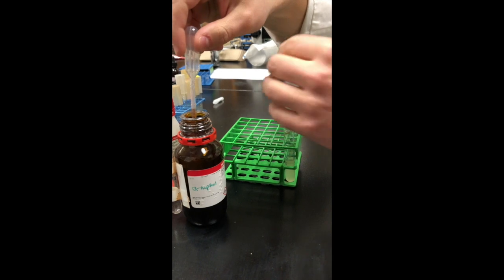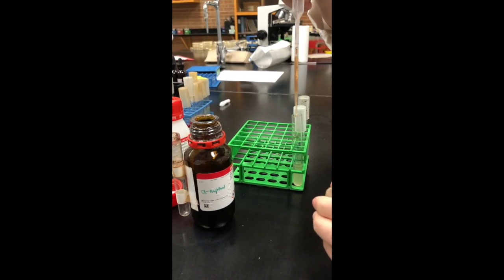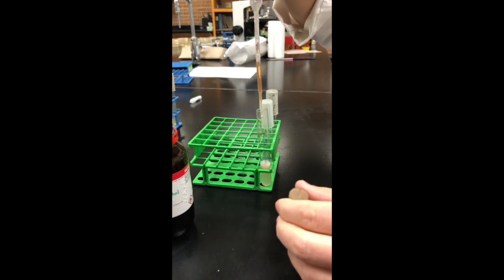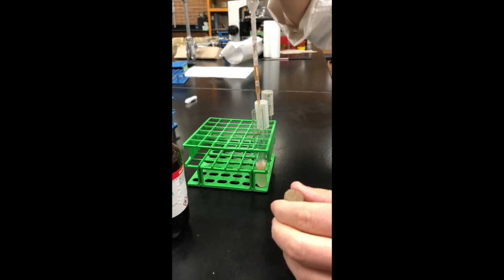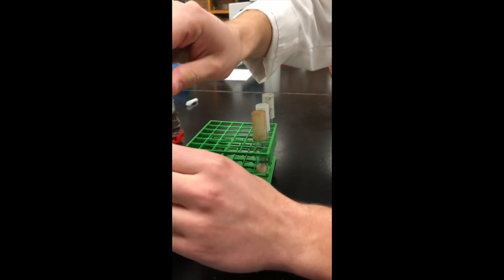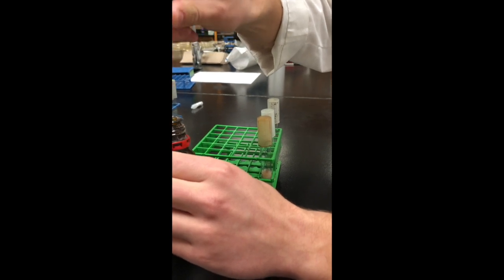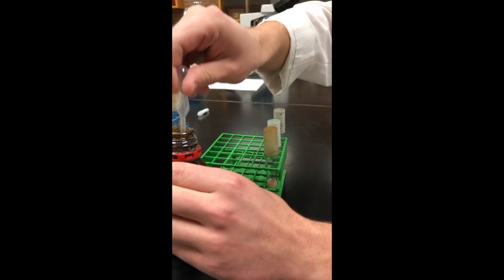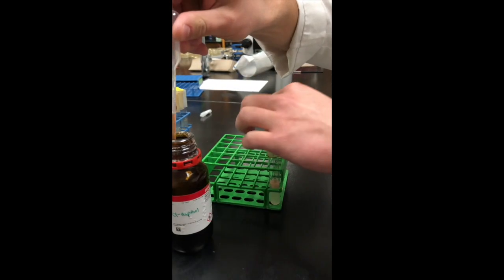So we're adding the alpha naphthol first. Notice the media gets really cloudy. This is kind of fun. That's right. That's too much. Just trying to pick up some. Can't touch it. All right.